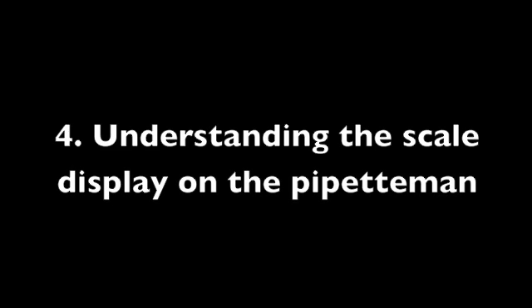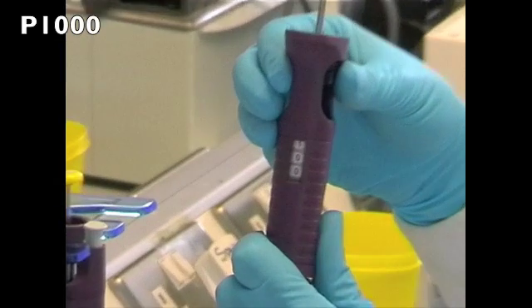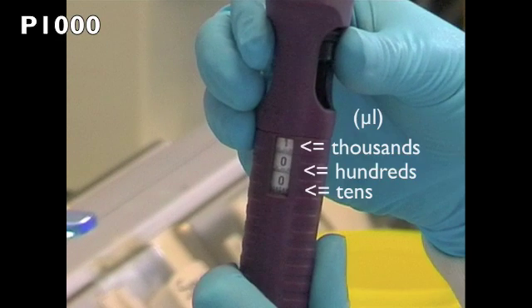Understanding the scale display on the pipetman is essential to accurate pipetting. On the P1000, the first number displayed, which is red, represents thousands of microliters. The second number represents hundreds of microliters, and the third number represents tens of microliters. The maximum capacity of the P1000 is 1000 microliters and this should not be exceeded, as it will damage the pipette and can result in inaccuracy for other users.